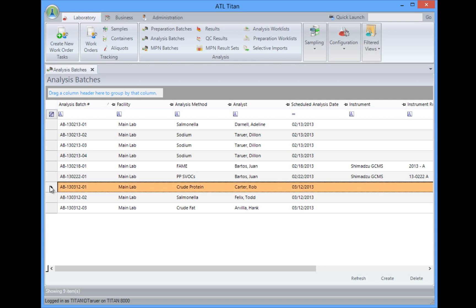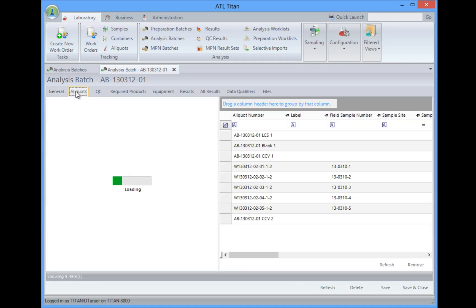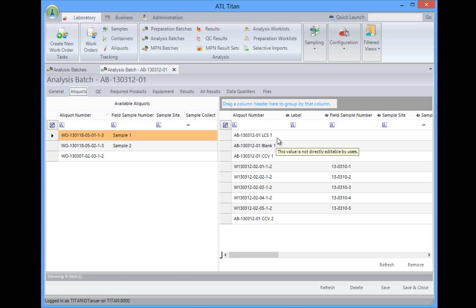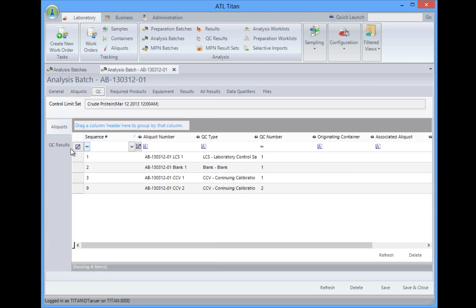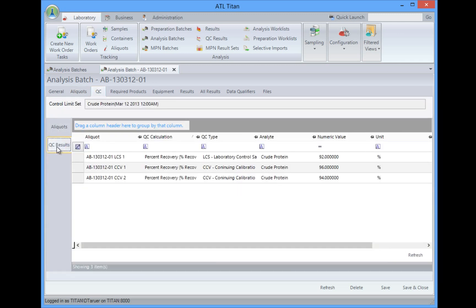So if we take a look at the crude protein, we can open this up and we can see when it was analyzed. We can take a look at the aliquots that were included, and if this was still in the creation phase, I could actually come in and add more of these samples to this. In this case, we have them already completed, and you'll notice we have a control sample, blank, and check standards included with this. We can take a look at the QC and even see the results right from here. So we had 92, 96, 94 percent recovery, which is good.